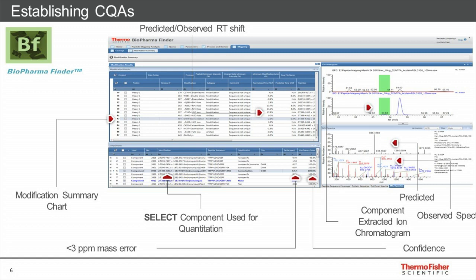It's actually looked and it said, well, I found a main peak here, and then I found a small satellite peak away from it. I'm expecting a retention time shift if it were an ISO-D of -1%. It sees it at -2% and says, yeah, this is probably an ISO-D. The peptide identity is confirmed from the MSMS spectra, and it has a retention time shift consistent with isomerization. Then it's done a lot of the work for me, which I like because I'm lazy, I guess.